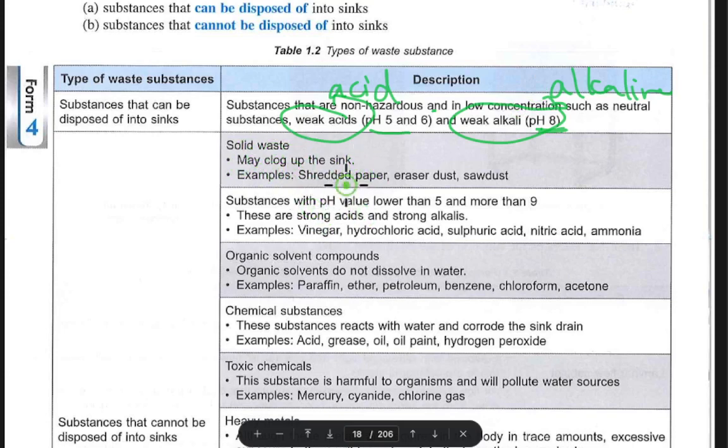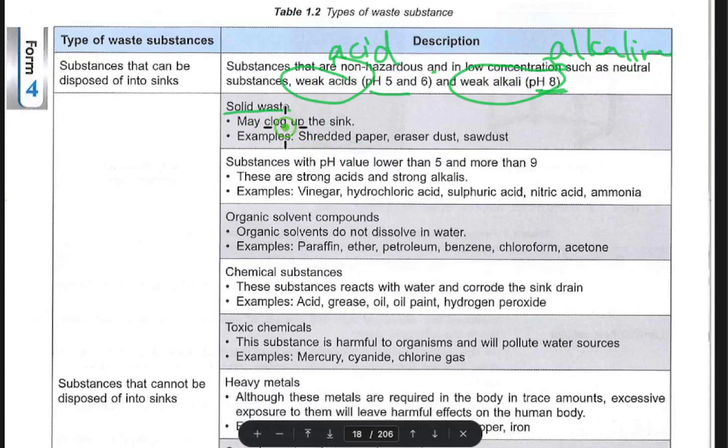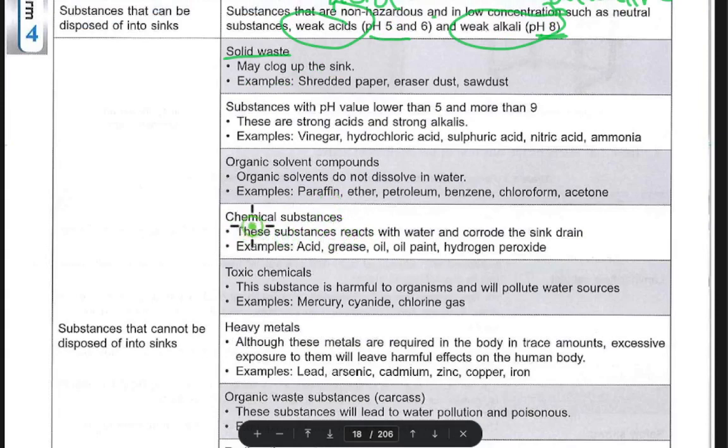Solid waste may clog up the sink. So don't throw solid waste. This one you know lah. Things that are solid. Substance, pH value, organic compound, chemical substance, you cannot throw.